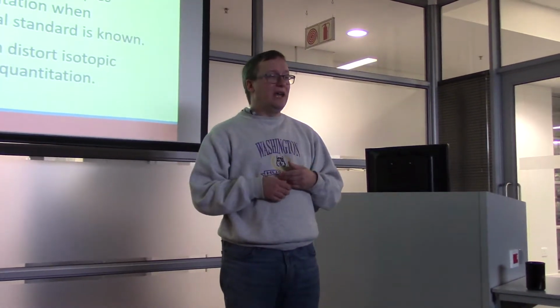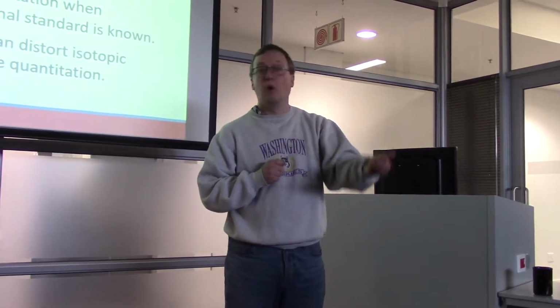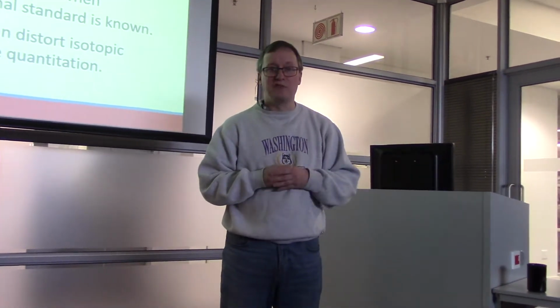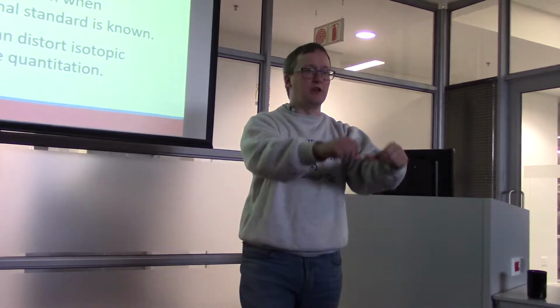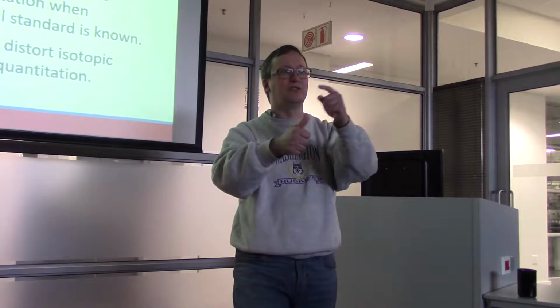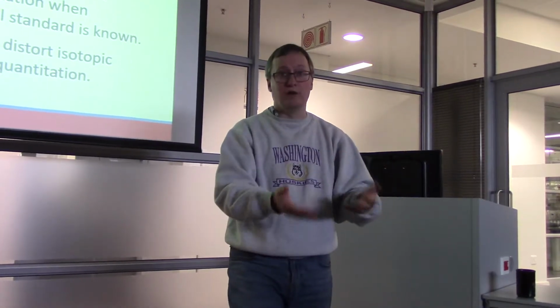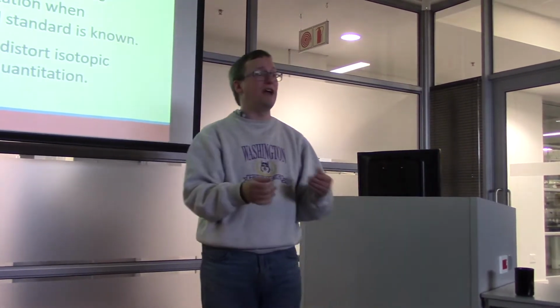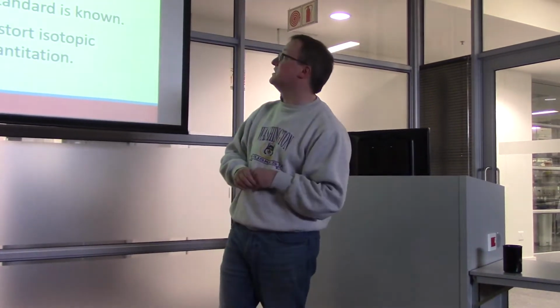When people do heavy oxygen labeling, it means that they're usually introducing heavy water, for example, in a digest of a protein, which means that when you use trypsin on a protein and it breaks a peptide bond, it's not sticking on an ordinary OH, it's sticking on an 18O and H. So you can see why that would be 2 Daltons higher than if you used ordinary water for this digestion. That's an example of how you can incorporate a label into existing proteins.